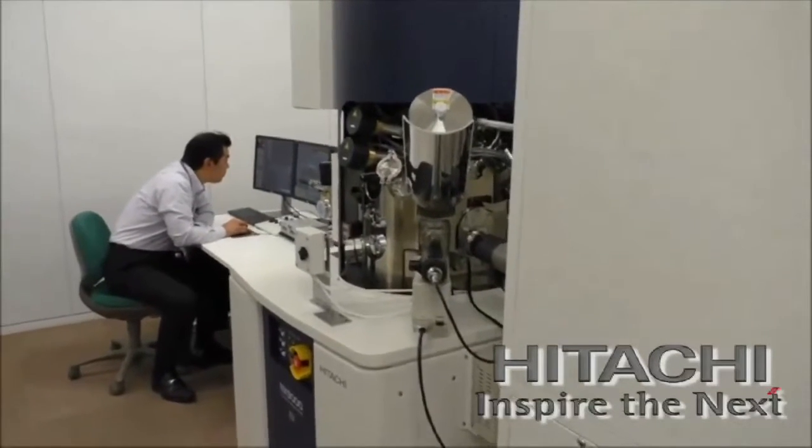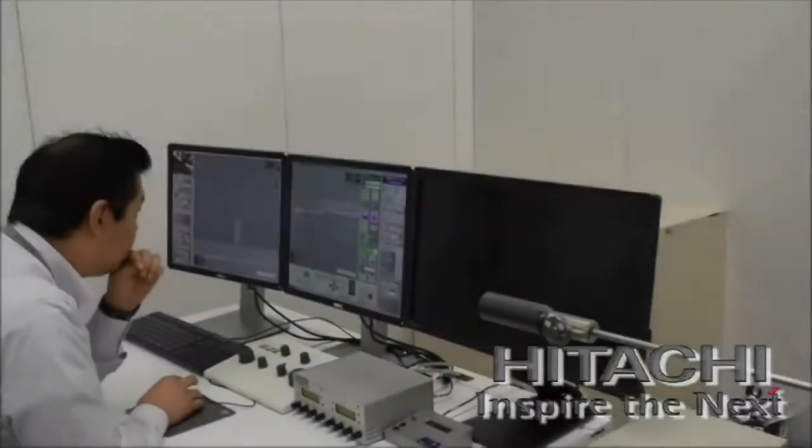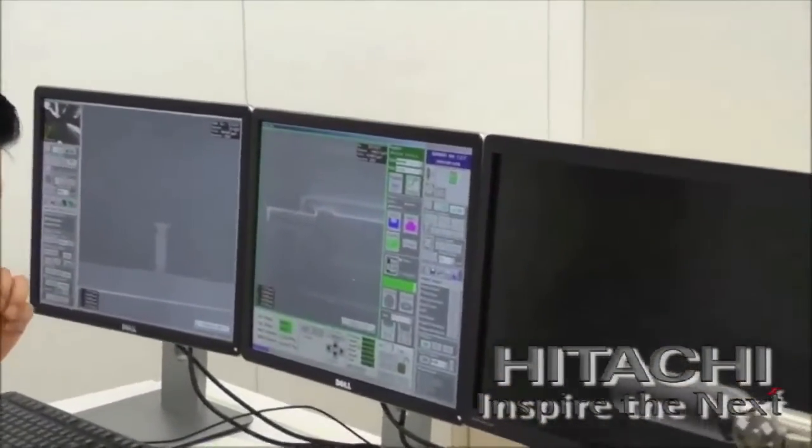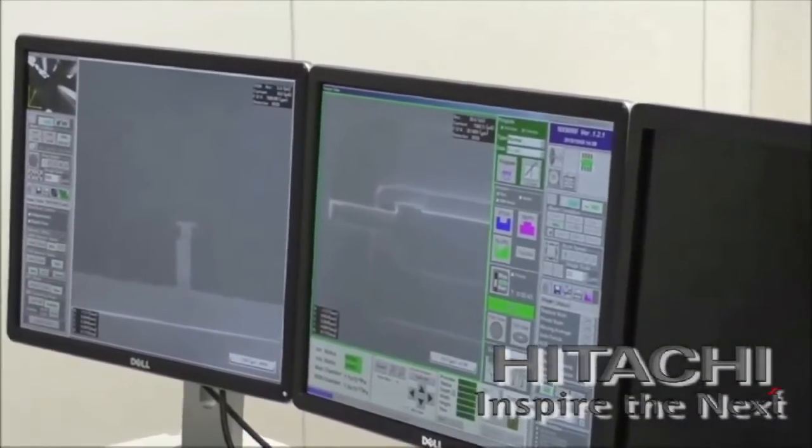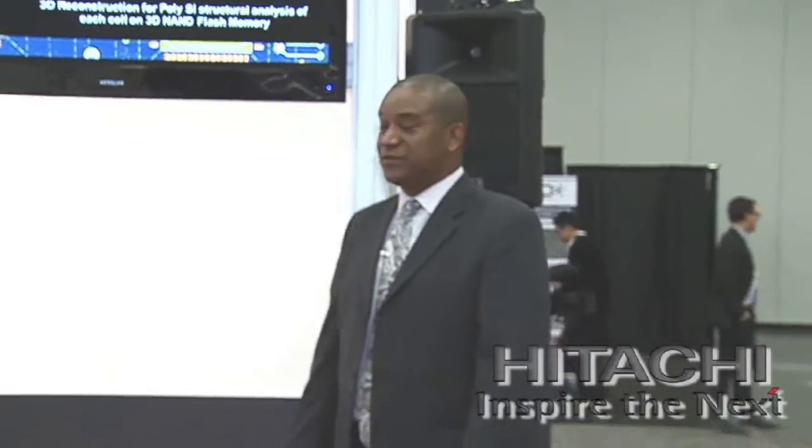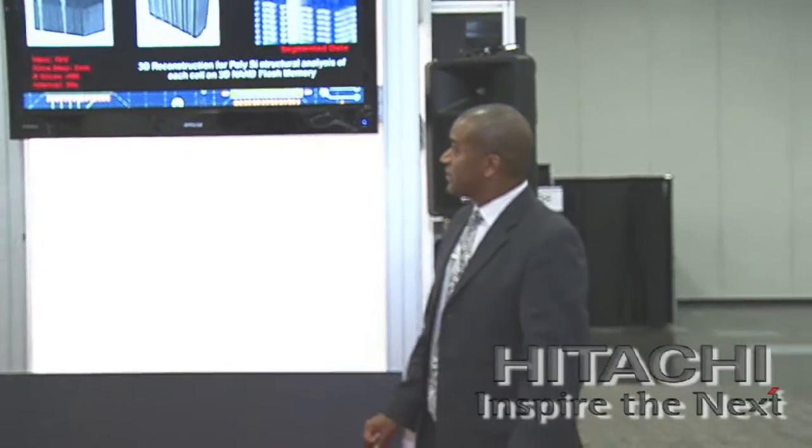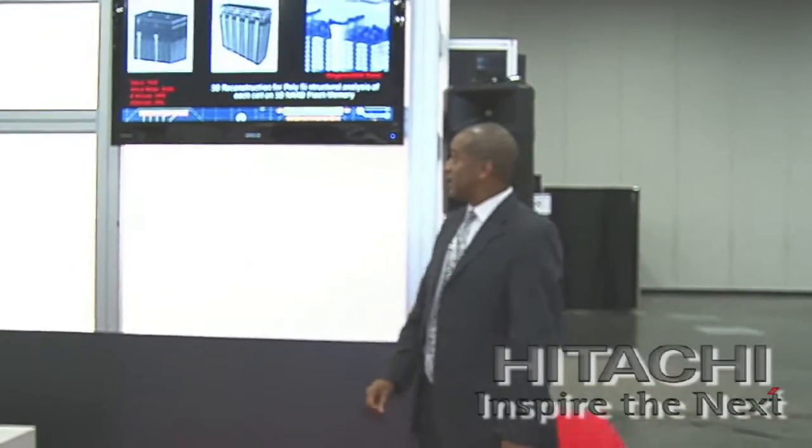It looks like we're about ready to view a few samples and some results of the NX9000 system in our virtual tour. So next, if we look at the segmentation, which is one of the most unique features, we're able to achieve 2 nanometer slice pitch for this particular data cube as shown in these examples.